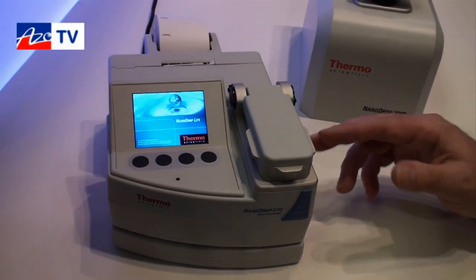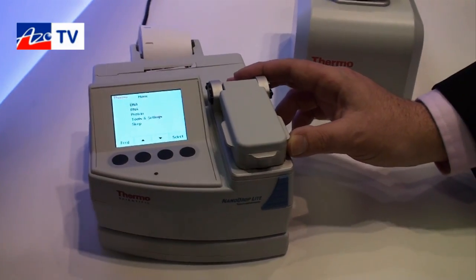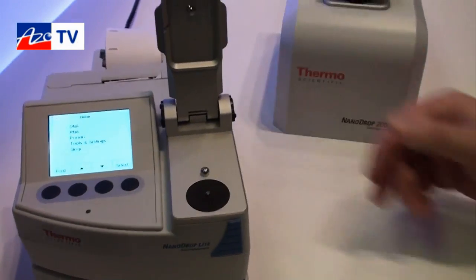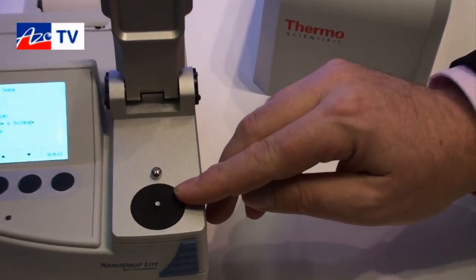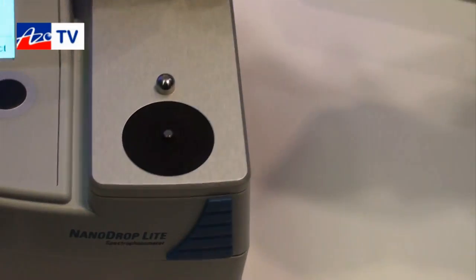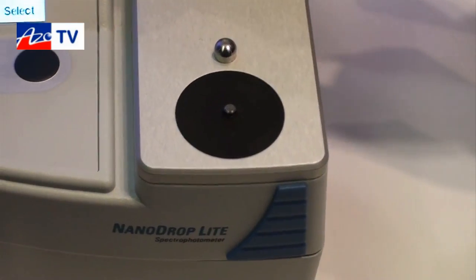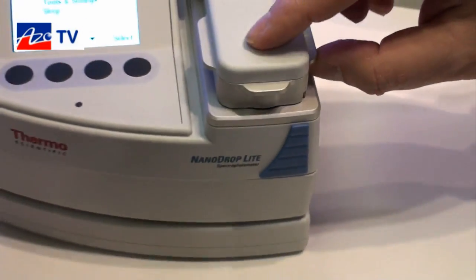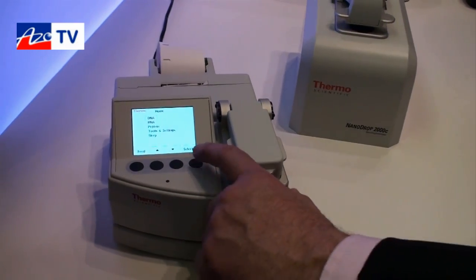What the system is really known for is the micro-volume sampling capability, which is here. Essentially we have a pedestal here — you would pipette a micro litre of sample onto the pedestal, then simply close the sampling arm and select the analysis you want to run.